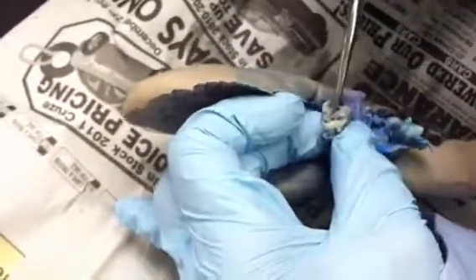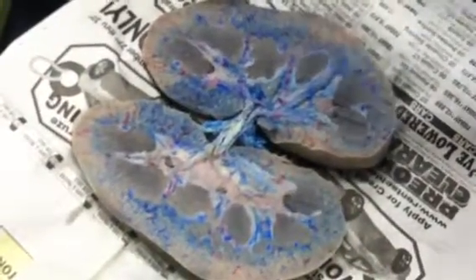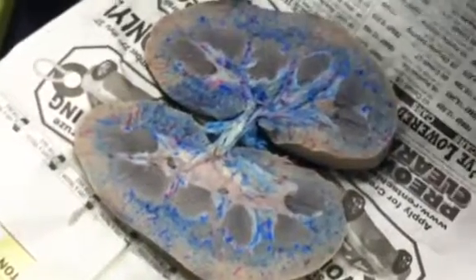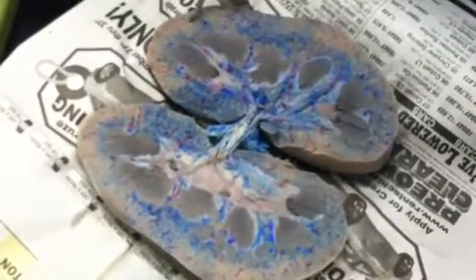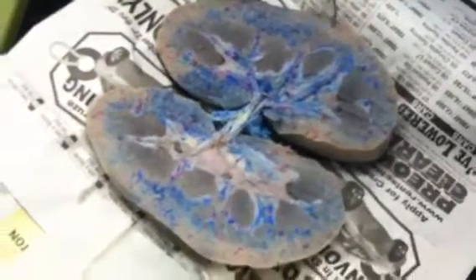So that's the renal artery, that's the ureter, that's a lymph node, and there should be a capsule on the outside, but there isn't. Then you open it up and you have the cortex, where 80% of your nephrons start. And these blue and red vessels are the radiate vessels. Those are the ones that supply the nephrons. These are the radiate ones. The nephrons empty into the blue ones. The red ones supply the nephrons.